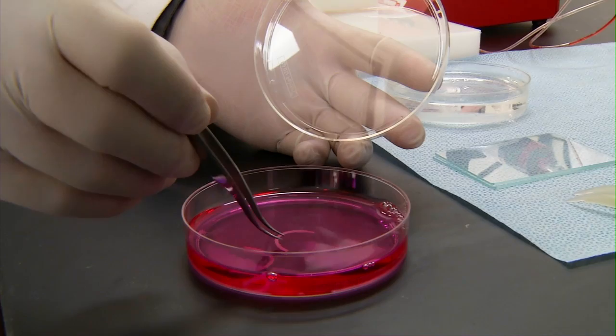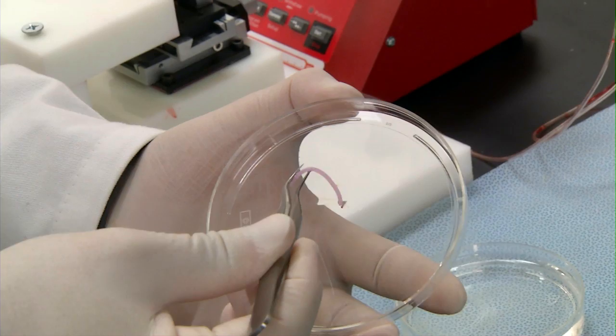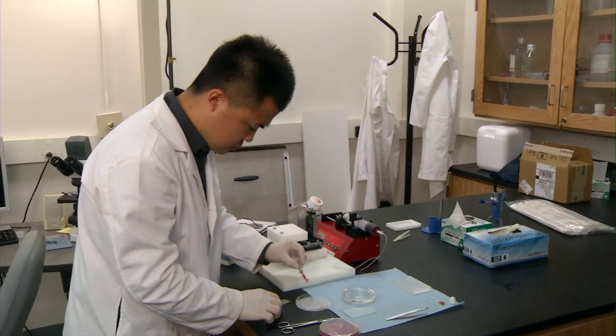Fabricating something that has a thickness greater than a centimeter is very challenging because the cells inside the bio-ink or the created structure cannot survive. They cannot get enough nutrients, growth factors, and oxygen. So in order to overcome this issue, we need to have blood vessels integrated within the printed structure. Instead of trying to get something that closely mimics the natural system, we have been fabricating microfluidic channels, cellular microfluidic channels.